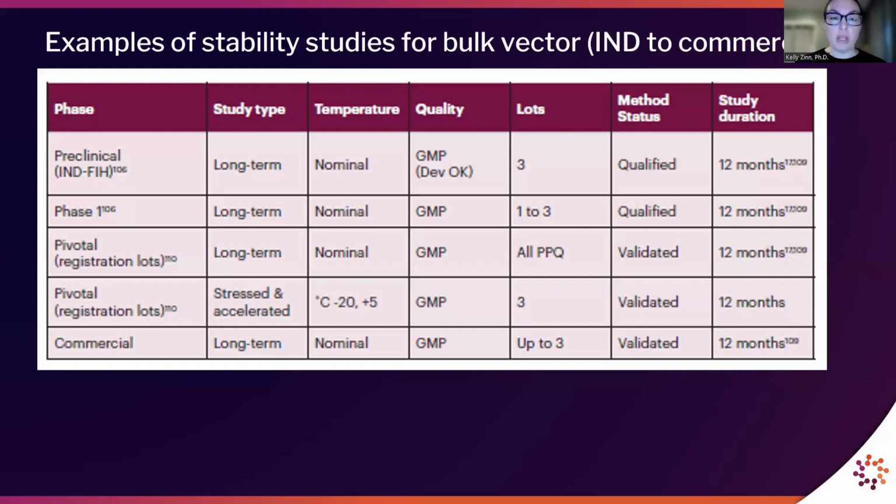Another consideration is making sure to use representative material in preclinical and clinical studies. And lastly, to set up the bulk stability real-time protocol to cover the expected duration of the time between manufacture to the time that the bulk is initiated for fill finish.